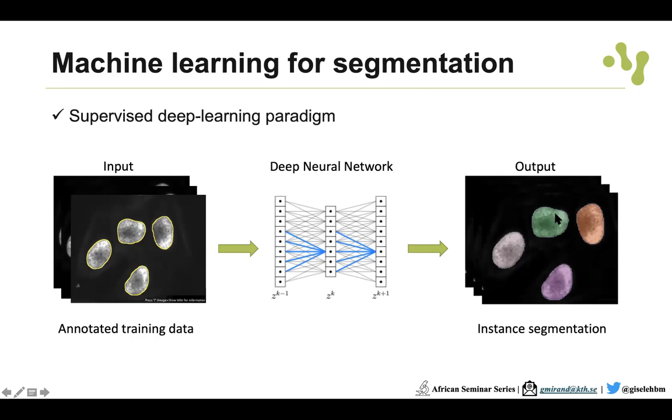So we will get results, what we call instance-based segmentation. Each particle here is identified. The good thing is that usually you need a lot of annotated training data, but if you can generalize in such a way that your model, when you present a new image to this trained model, then you will get your output, your segmentation output.